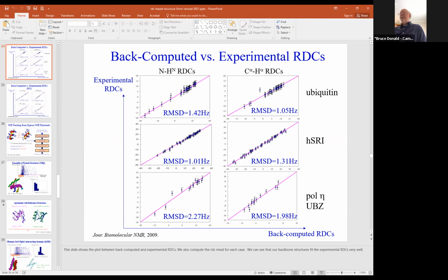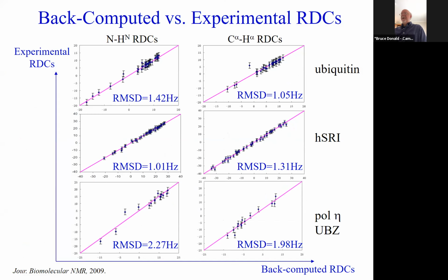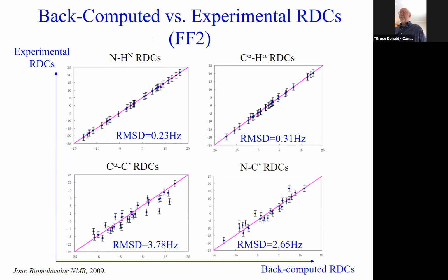Now we can also measure how well we can pack these things together. This is one of the reasons for my claim that we get good fits using any of these techniques. This technique really is using essentially NH and CH in 1 or 2 media. 2 media is better if we can do it. Again, this is for a new protein, FF2, again, rather good.